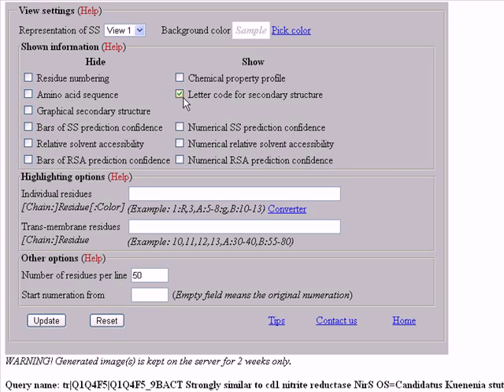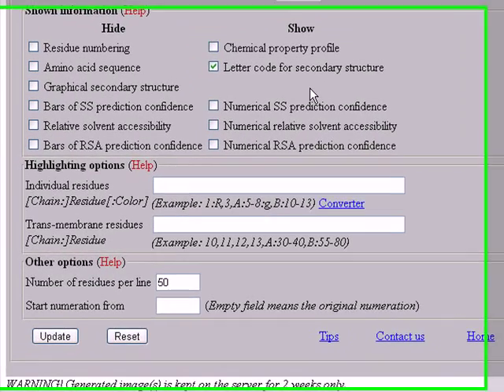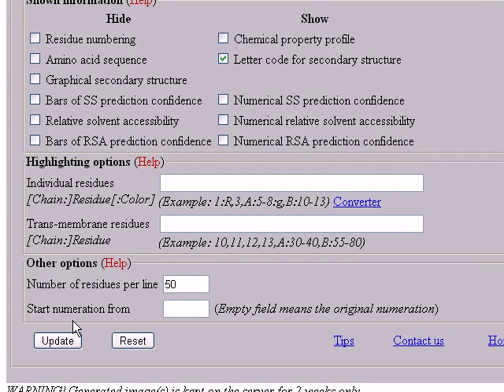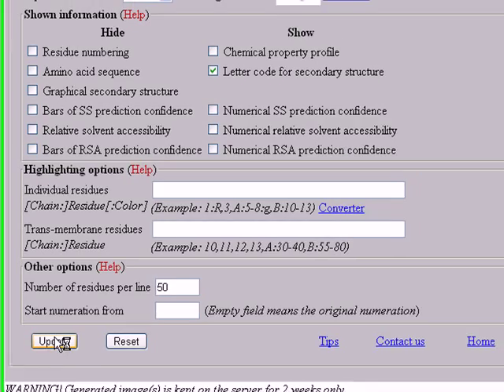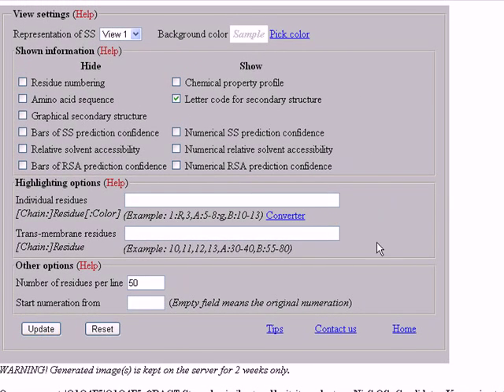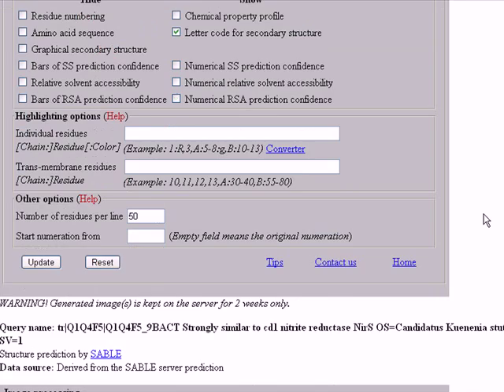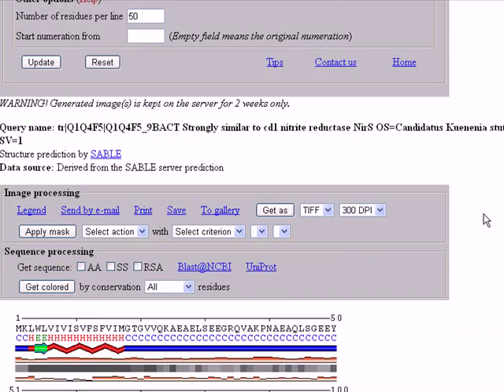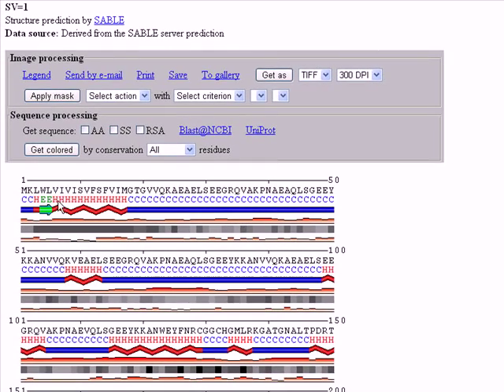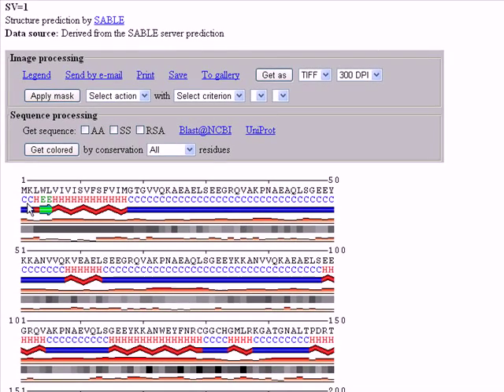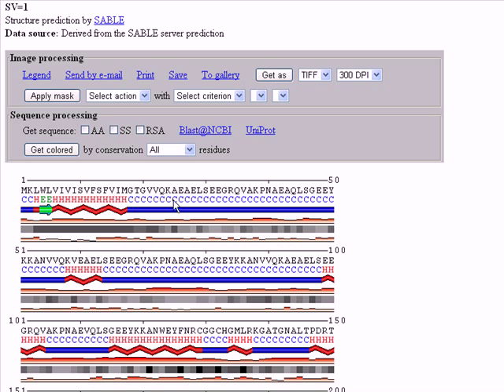We select here the letter code for secondary structure and we click update. Okay, we can see here the letter code. The C stands for coil regions, the H for helices or alpha helices, the E is for extended or beta sheets. You can see our sequence here and the single letter prediction is in the second line.